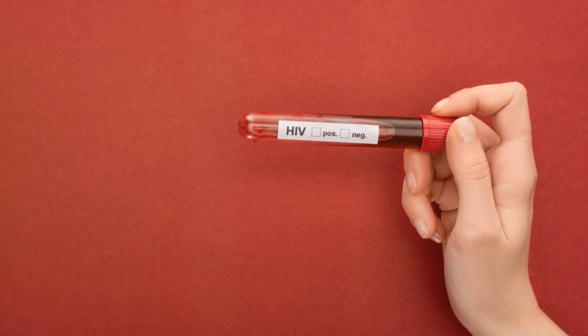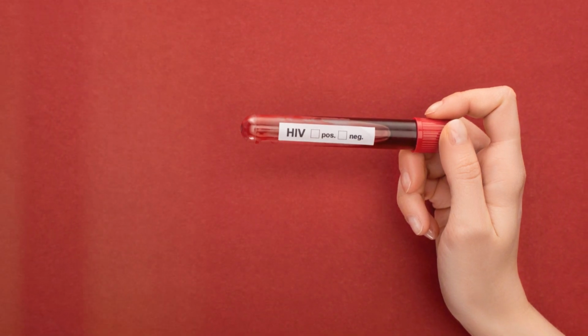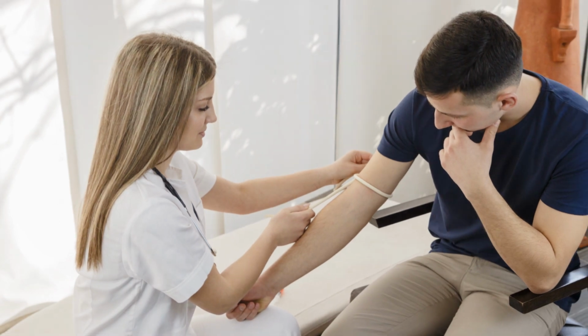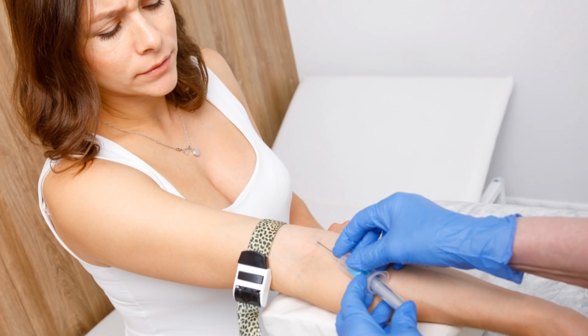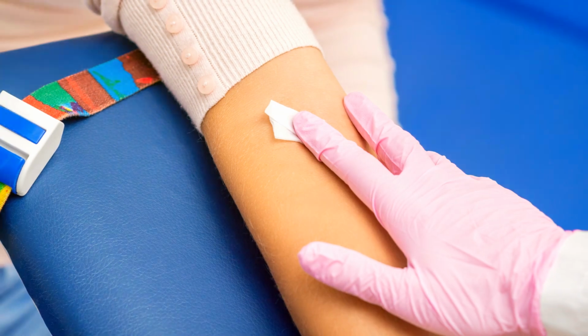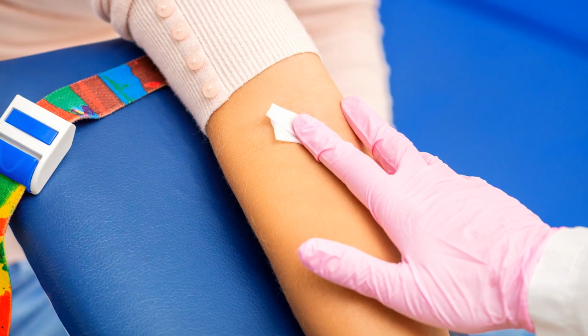The standard emphasizes the importance of clear, legible, and accurate labeling of all sample containers, which is vital for subsequent processing. This includes information such as the patient's name, date of birth, unique identification number, sample type, and the date and time of collection, all of which are essential for proper identification.